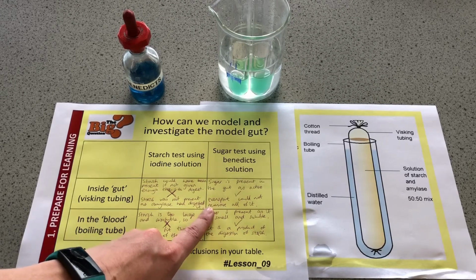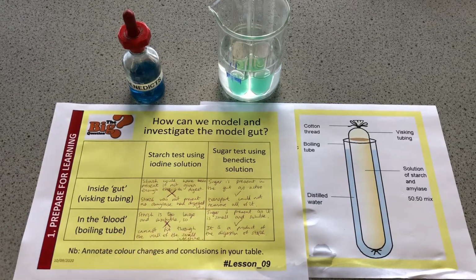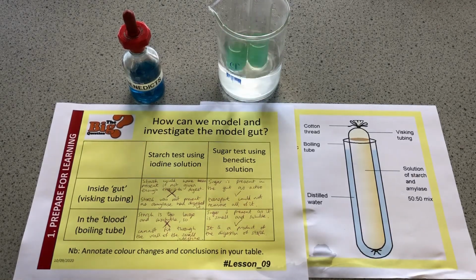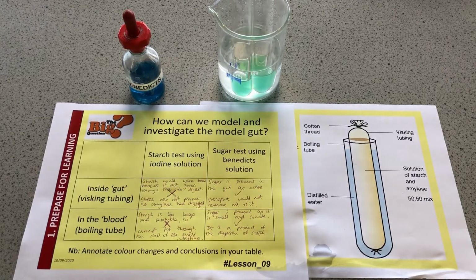Inside the gut we still had some sugar present because we said that initially that sugar moves across by diffusion. When we get to the equilibrium, which we definitely can see here, the rest of that sugar is pulled across into the blood by active transport, and that couldn't happen. We didn't have the energy supply, we had no mitochondria, so we couldn't pull the rest across. So that's why we found some sugar still present in the small intestine.